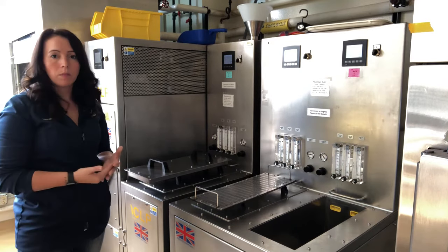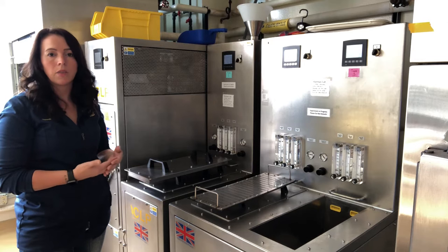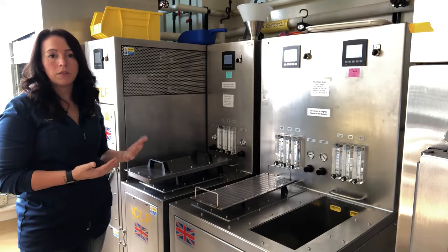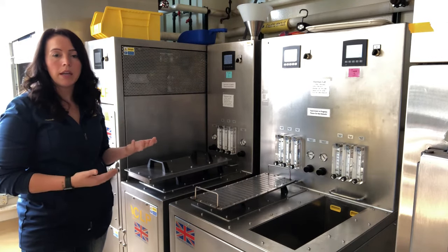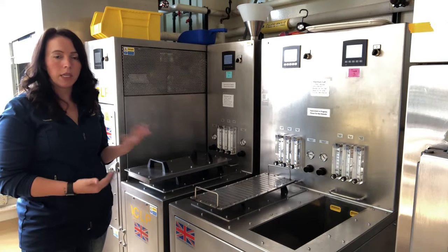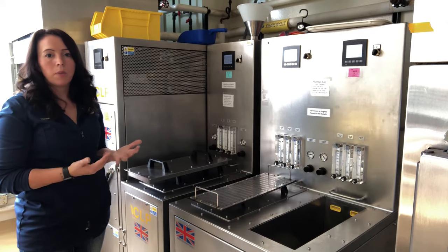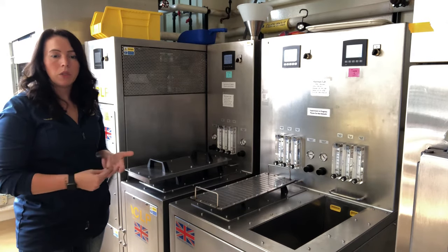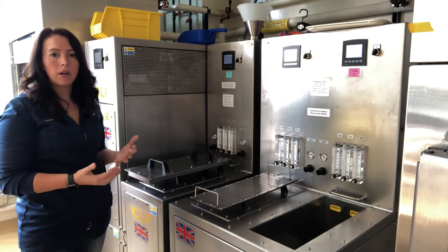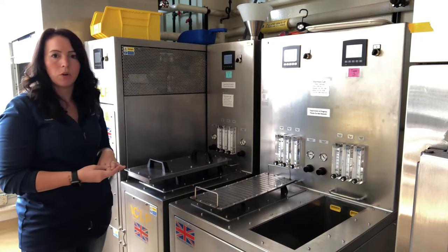But now we're getting into brewing and playing around a lot more with what types of malt we're able to make. This kiln, beyond just doing a certain temperature for a certain time and then kicking to the next phase, can also control based on differentials below and above the bed — either a temperature differential or a moisture differential — and kick to next phases. That's made it possible for us to make lager malts, Viennas, Munichs, and caramels. A lot of really good control and variation that we're able to get out of this kiln.